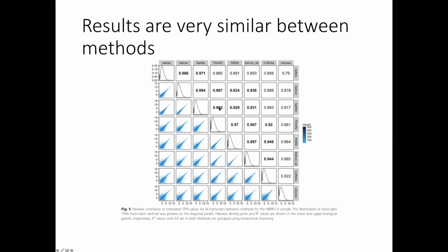And this one is the first version, you could say, of these 3, so these 2 are behaving more similarly. And then these are the 3 where you were mapping to the transcriptome, and they are also getting very similar results.